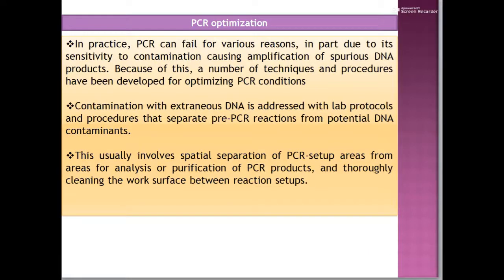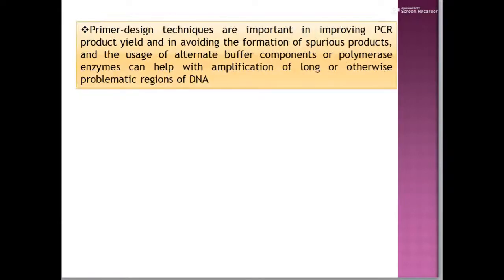And whatever be the type of reaction that you carry out, PCR optimization is always needed, because sometimes extraneous DNA can come in, and the amplification of DNA might not be present sometimes if too much DNA is present. So the process of PCR optimization becomes quite essential, and primer designing techniques are also important to improve your PCR reaction. And I hope you got an overview of the PCR techniques in a brief way.